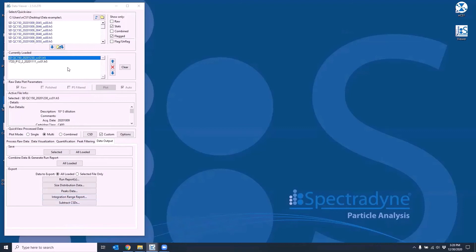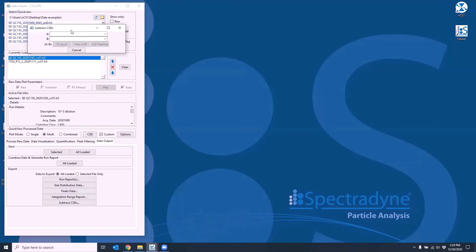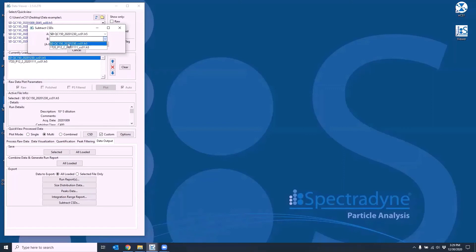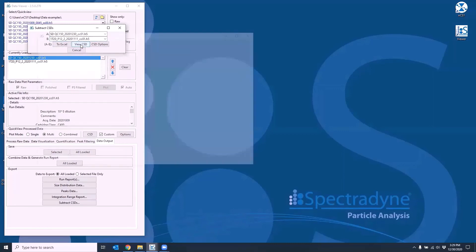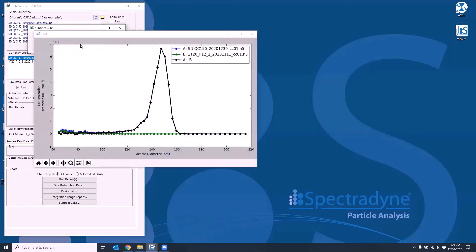For example, I have a combined file from a sample run and a combined file from a blank measurement run. Now let's see what the actual size distribution of the sample will be if we subtract the blank. So select A to be the sample and B to be the blank and click on view CSD. We can see now that the blank subtract data is shown as a black curve on this graph.